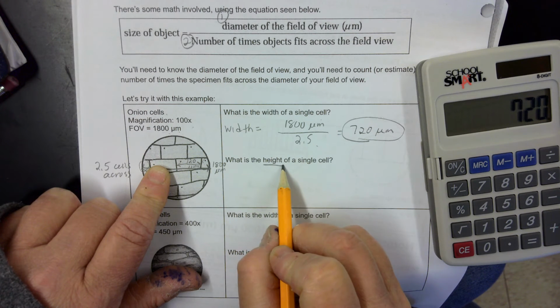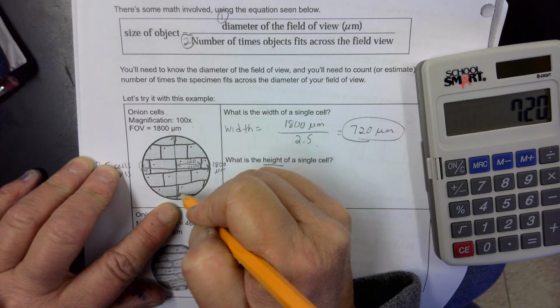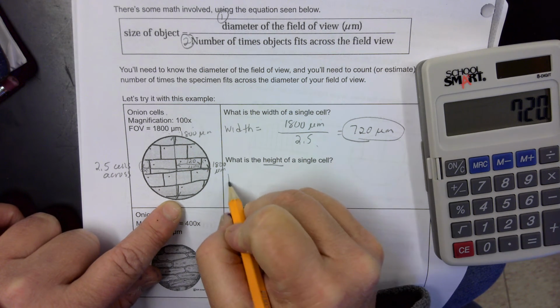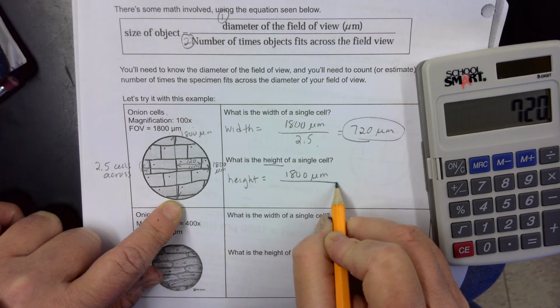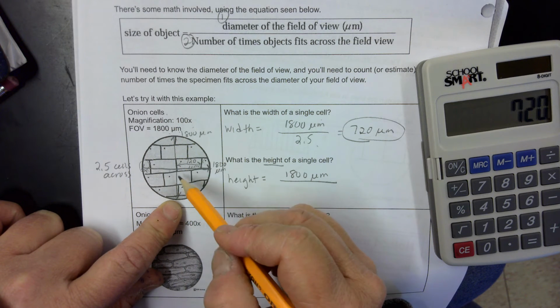What's the height of a single cell? Well, this is really no different, but now we just have to think vertically. So this field of view right here is also 1800 micrometers because it's a perfect circle. So the height is equal to the field of view of 1800 micrometers, and we're going to divide that by the number of cells that we can stack going up vertically. So let's count the full cells.